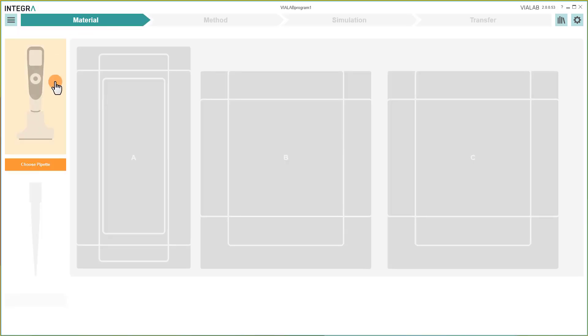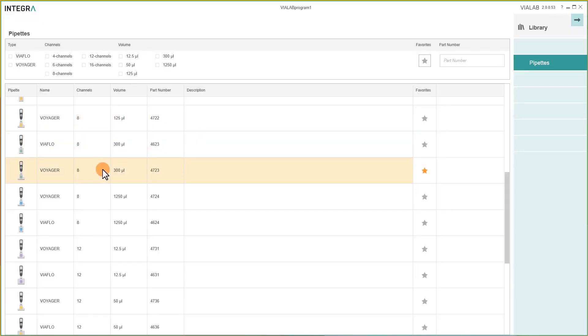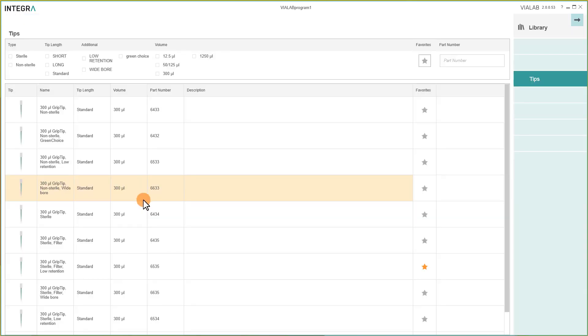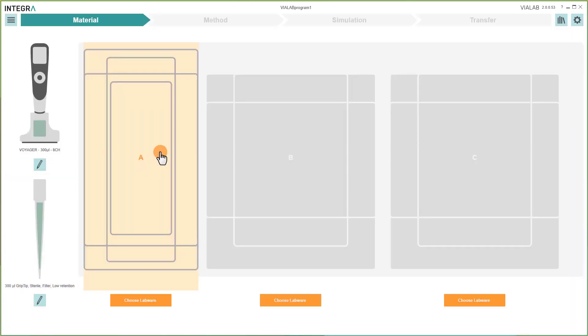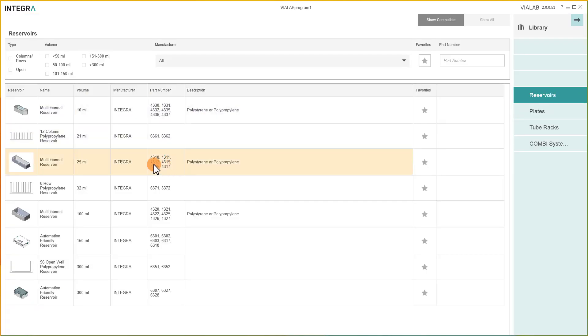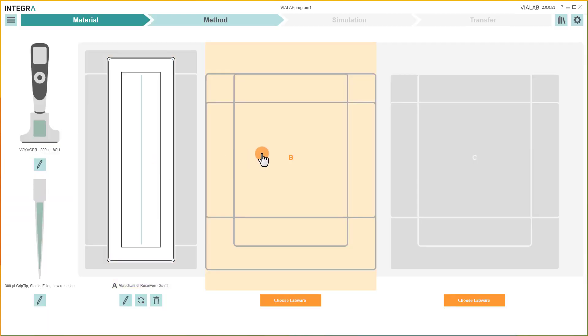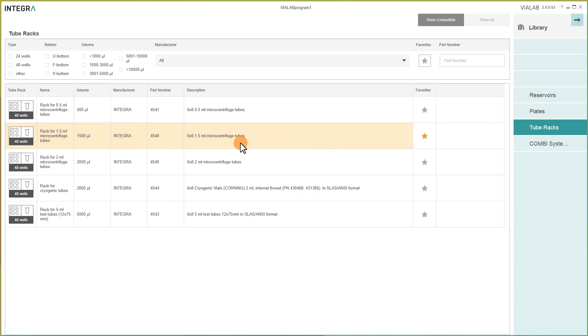In the section Material, you pick a pipet and tips. Simply select the desired deck position to place a reservoir, a tube rack, or a plate to the desired position on the deck.